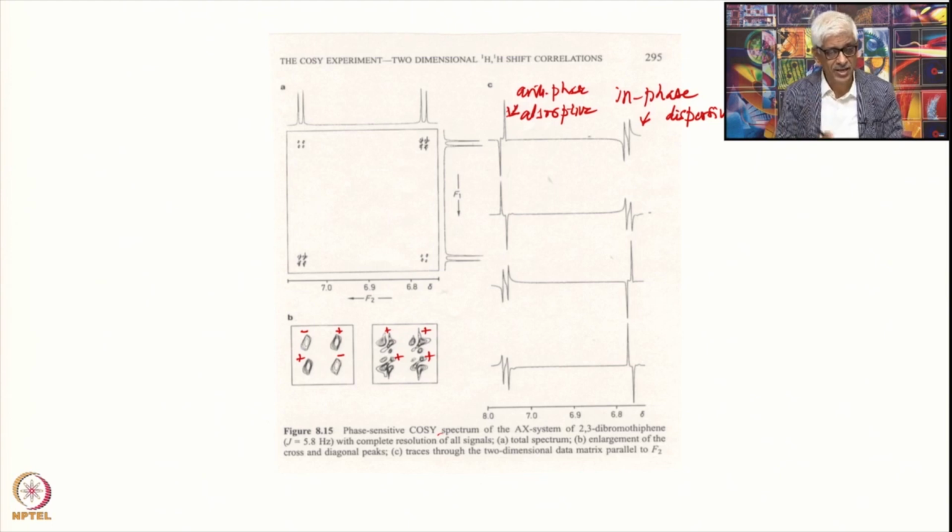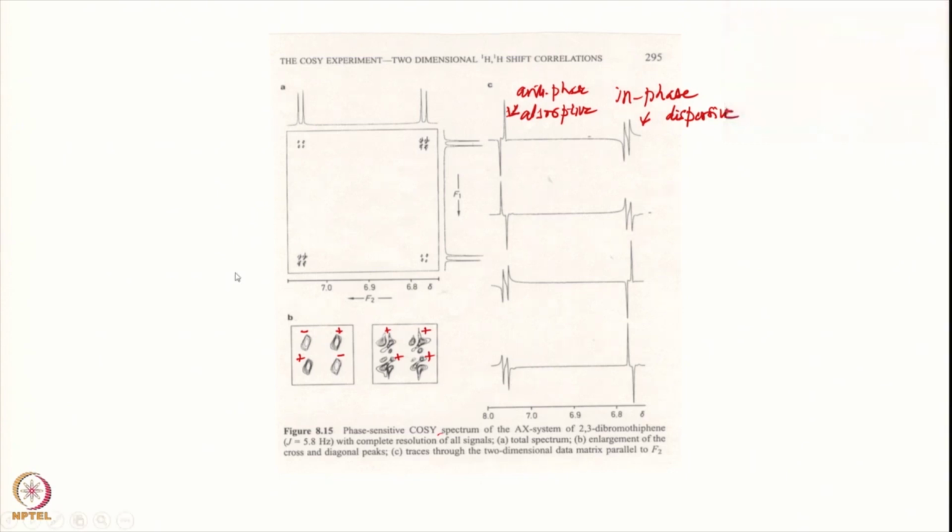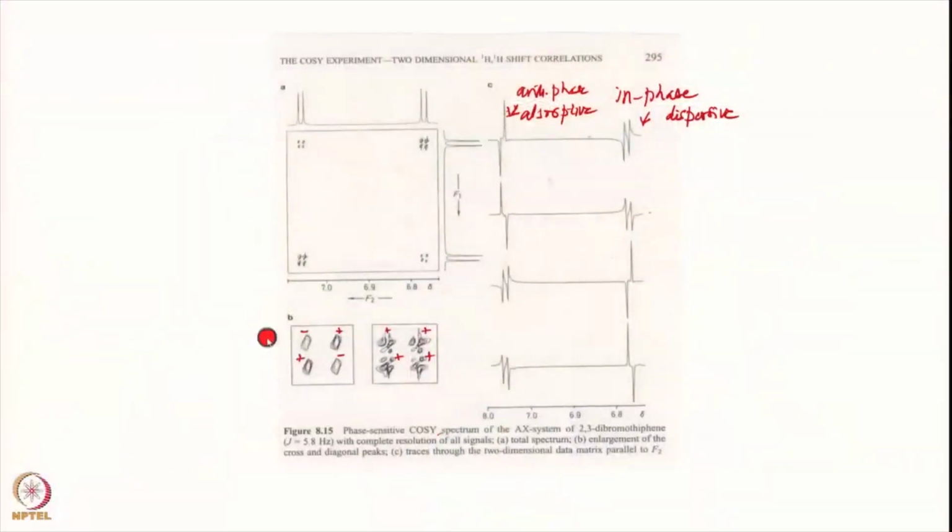Therefore in a correlated spectrum recorded with high resolution, a COSY spectrum recorded with high resolution, you will be able to see such fine structure. If you do not use high resolution, there can be possibilities of cancellations. Notice also that because of these intensity patterns, with positive and negative peaks here, suppose you do not have enough resolution along this axis.